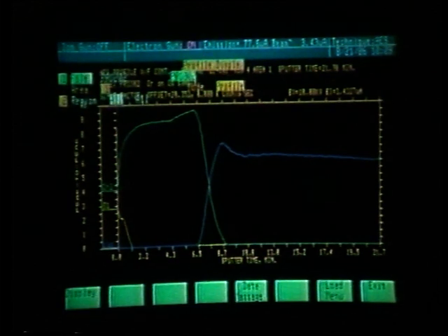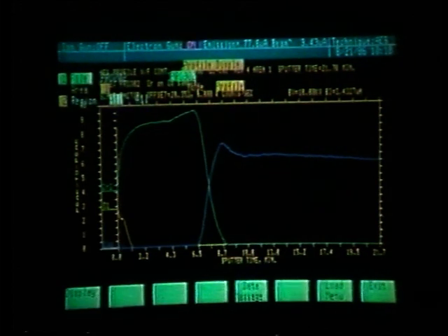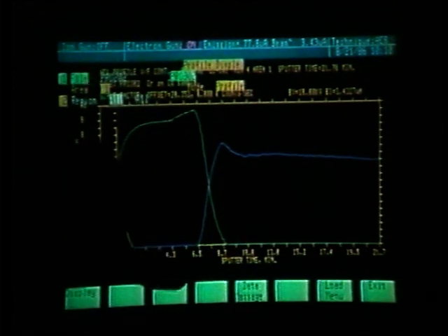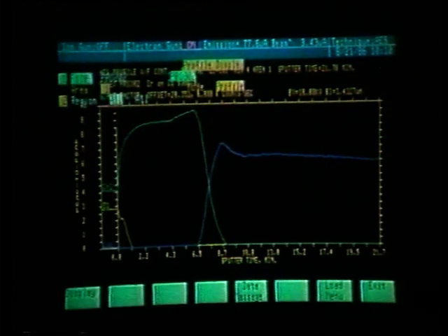Because of the number of data points, we see a little bit more structure in the oxygen before it disappears from the surface of the chromium. We see the interface between the chromium and the copper. Because the peaks may have shifted slightly, we do also see some structure at the interface, both in the chromium and the copper peak-to-peak heights.